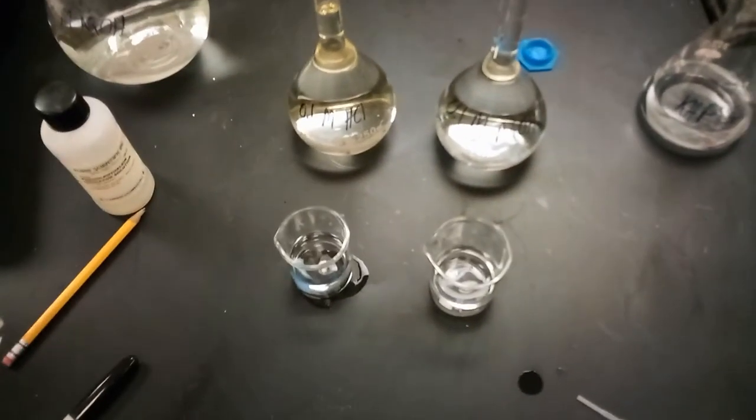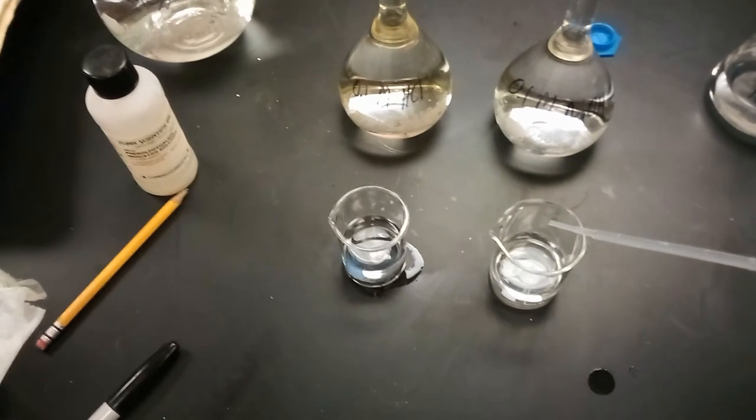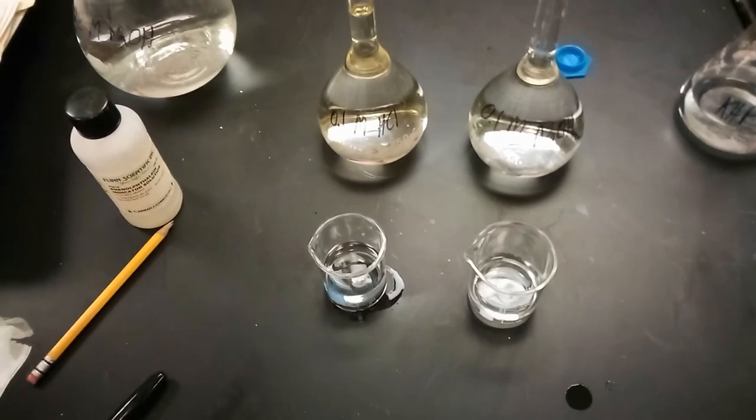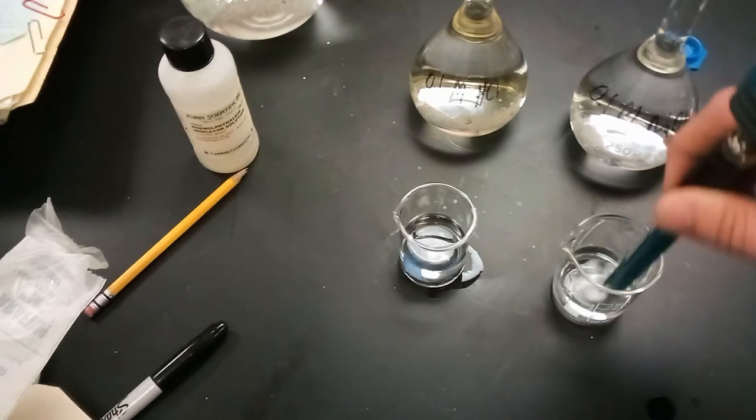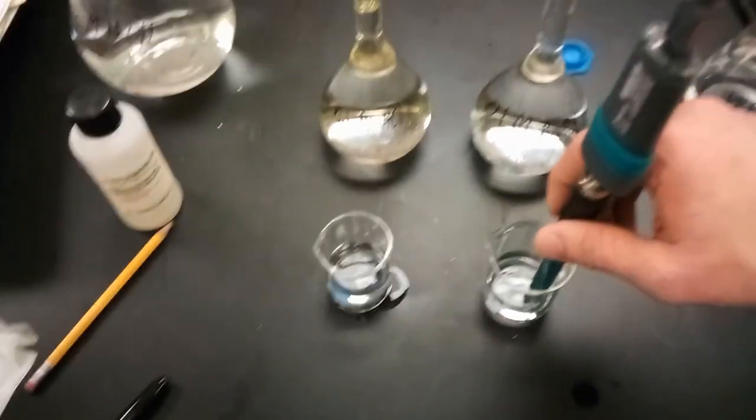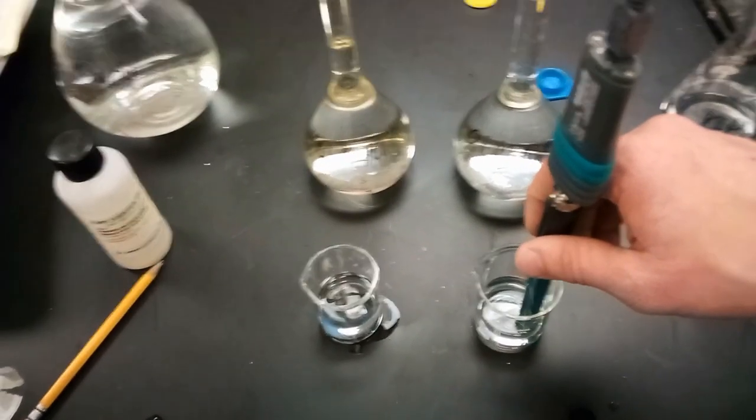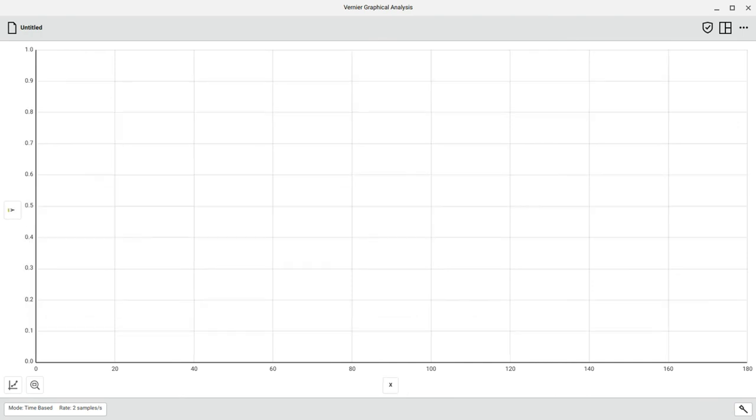And then we'll repeat again with the sodium hydroxide: one, two, three, four, five. Move the pH probe from the distilled water into the beaker with the sodium hydroxide, and then compare the differences in pH levels. Again, you should hopefully see more drastic changes this time around in pH levels.